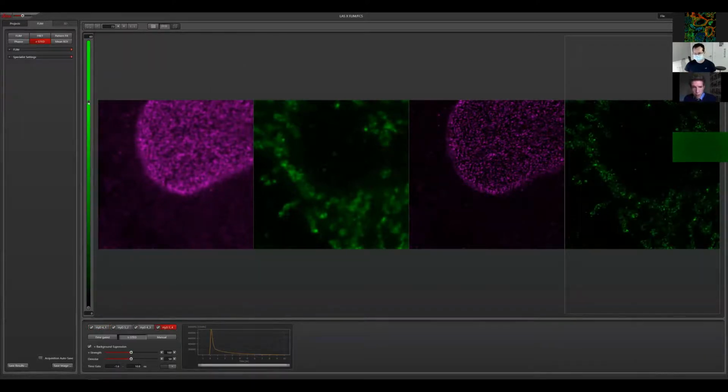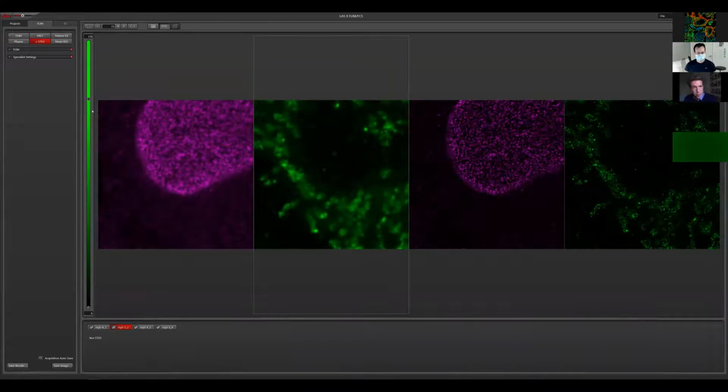Cool. I see you're ready, Mariano, so maybe... Yes, so I will now do a small introduction about the sample. The sample is not maybe as nice as the one that you showed, but it's still good. For now, we're just starting with a classical multicolor setup using two dyes from two different spectra. Here we have the nuclear pore stained with Abberior Star 580, and the mitochondria, this time tagged with Abberior Star 635P. So two different windows, we do two different sequences.